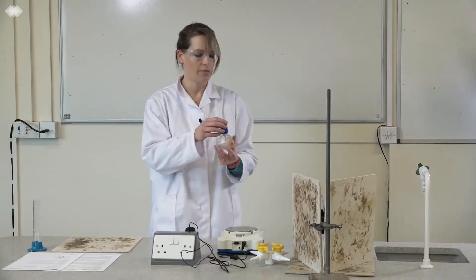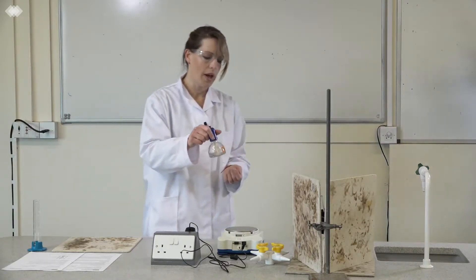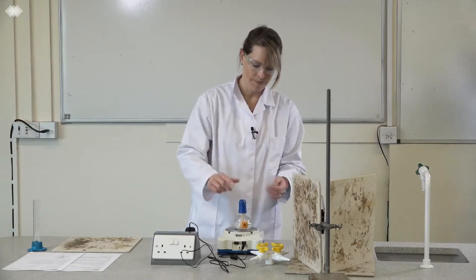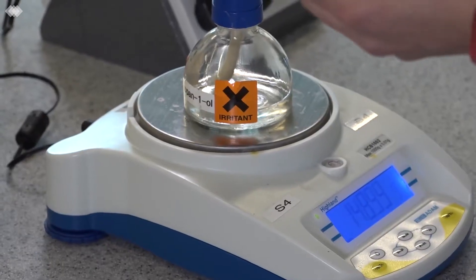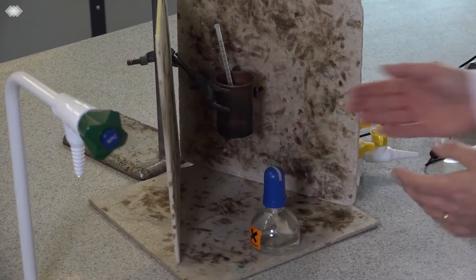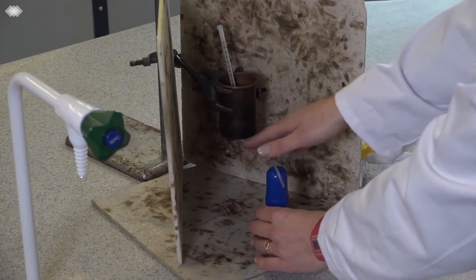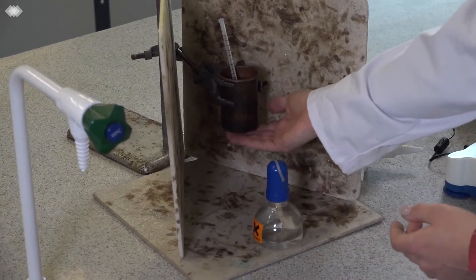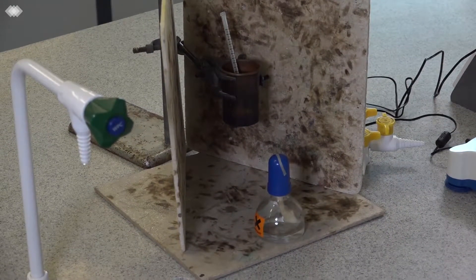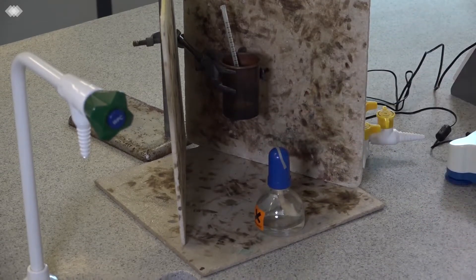Next thing to do is to take the spirit burner containing the alcohol and that needs to be weighed on a balance with the lid on. Record the mass. Now it's important that you decide the height of the calorimeter so it's not too high above the spirit burner because you want any of the heat to go directly into the calorimeter and not be lost into the surroundings.